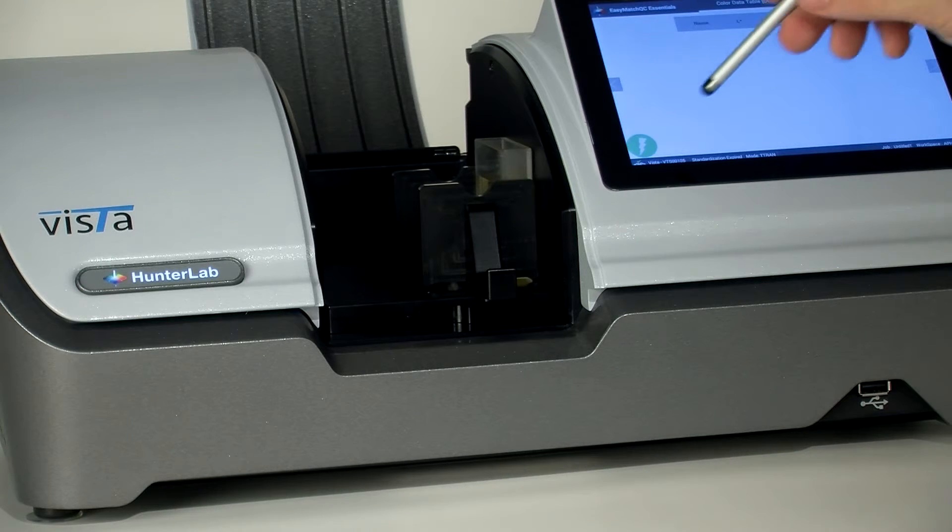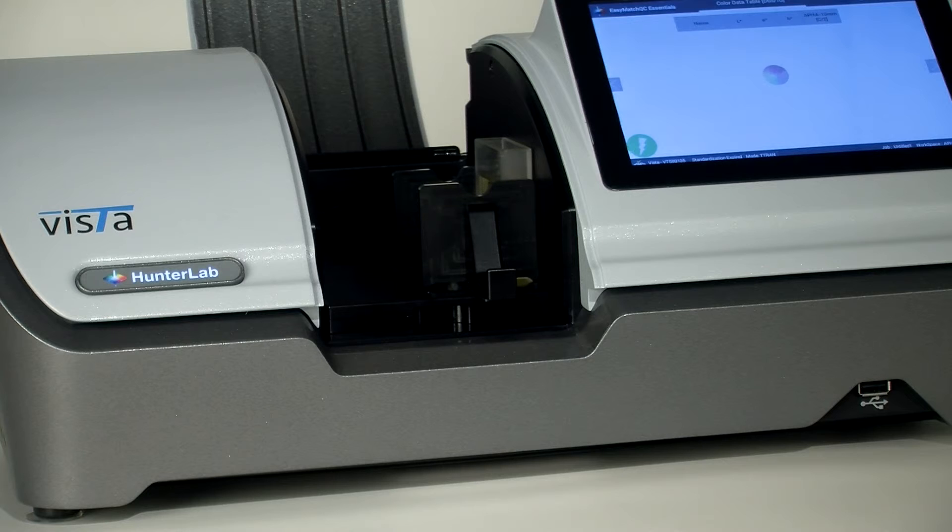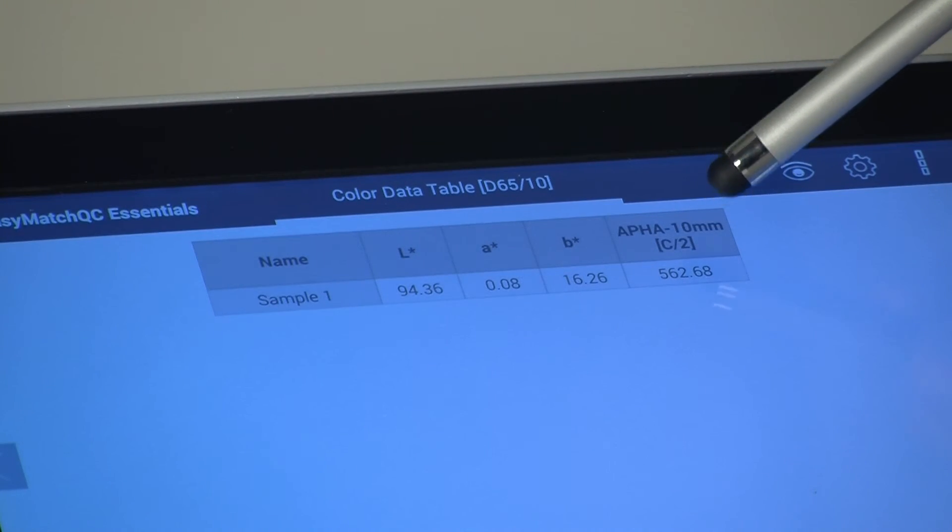Now press Measure. APHA values will be displayed on the screen.